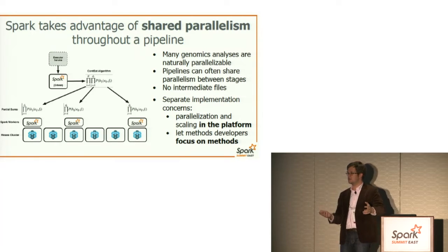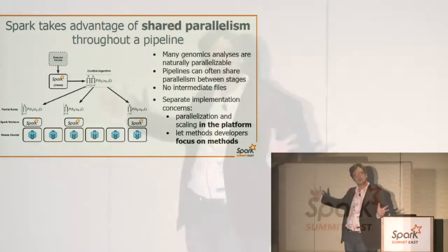Databricks likes to talk about how they break sorting records. That's really exciting to me as a person in genomics and bioinformatics. It also means that we can start thinking about a world in which we don't have to keep around every single intermediate file. We're not going to disk. We're not saving these files. We're not getting the subsequent explosion in data size that people experience. And finally, I'll talk a little bit about this at the end, it allows us to separate concerns: methods developers on one hand and people who focus on performance and execution of the platform on the other.